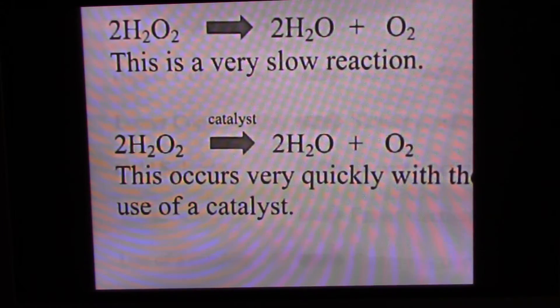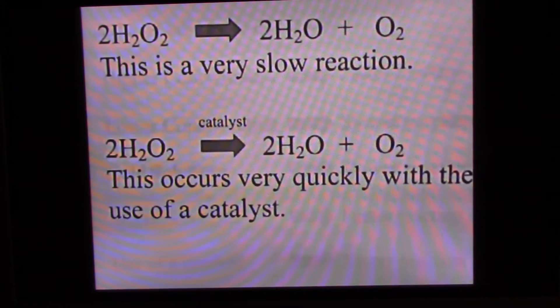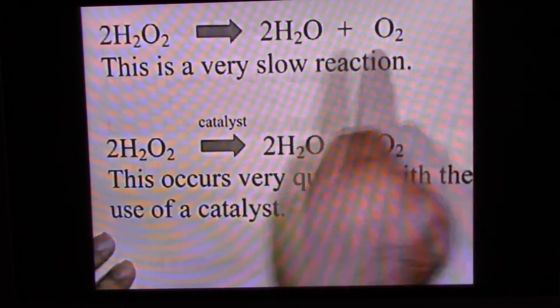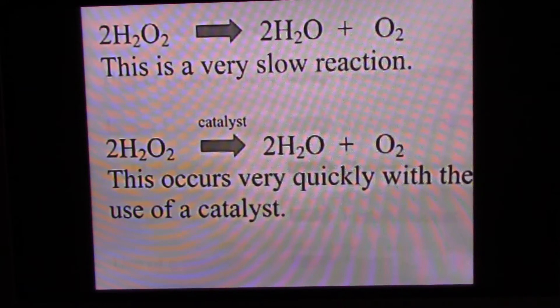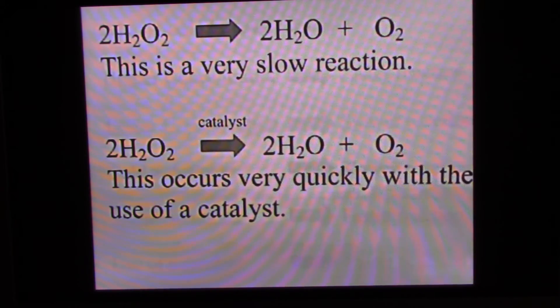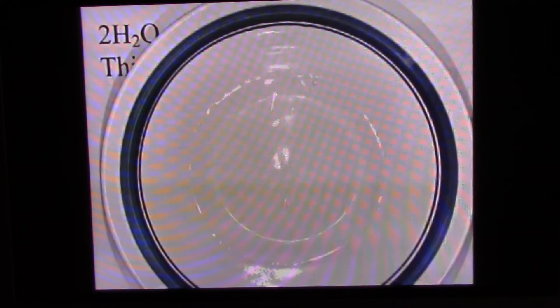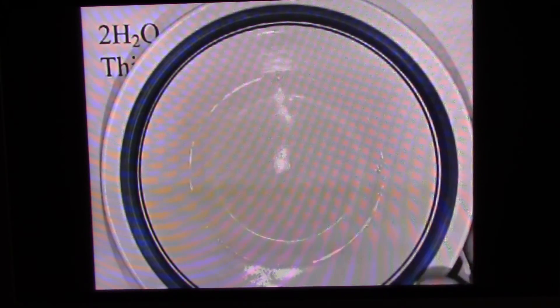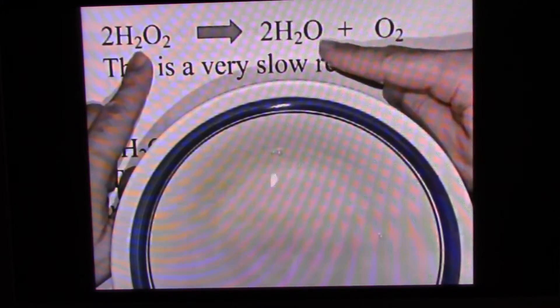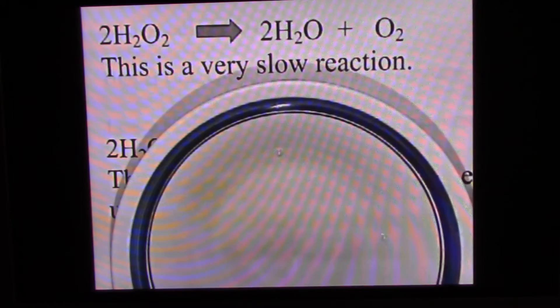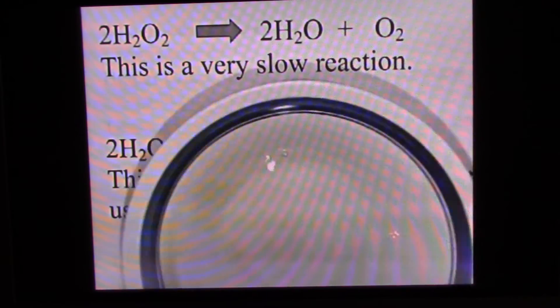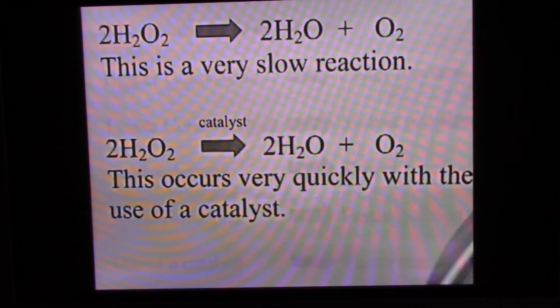There's one more type of reaction involving hydrogen peroxide. Hydrogen peroxide decomposes into water and oxygen very, very slowly. But we can make the reaction go faster if we use a catalyst. A catalyst is a substance that makes a reaction go faster — it does not get consumed in the reaction. It interacts with the reactants and then leaves intact; it can be used over and over again and is not destroyed or turned into anything else.